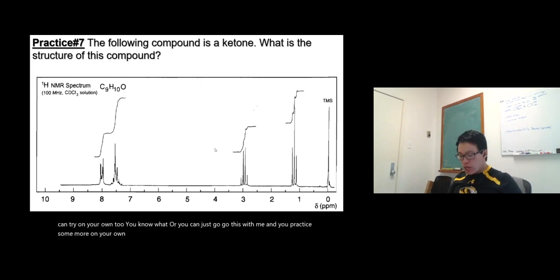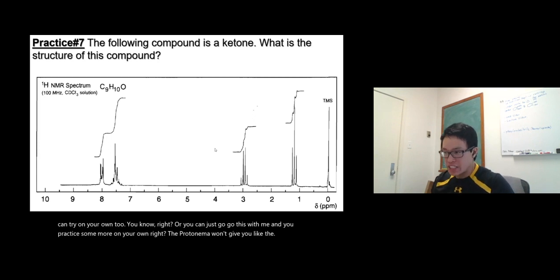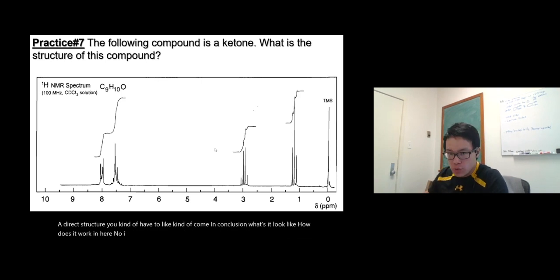All right. The proton NMR won't give you a direct structure. You kind of have to come to a conclusion. What does it look like? How does it work in here? All right, so let's do this together.